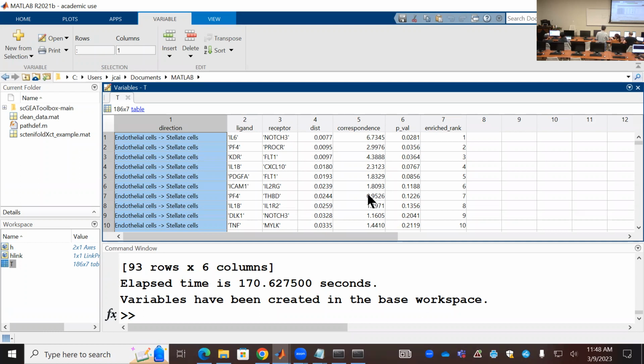Maybe not in the list. In that case, you want to keep that gene. You can do something like this: I want to keep the top 8,000 highly variable genes, and see whether the gene you include is still there.